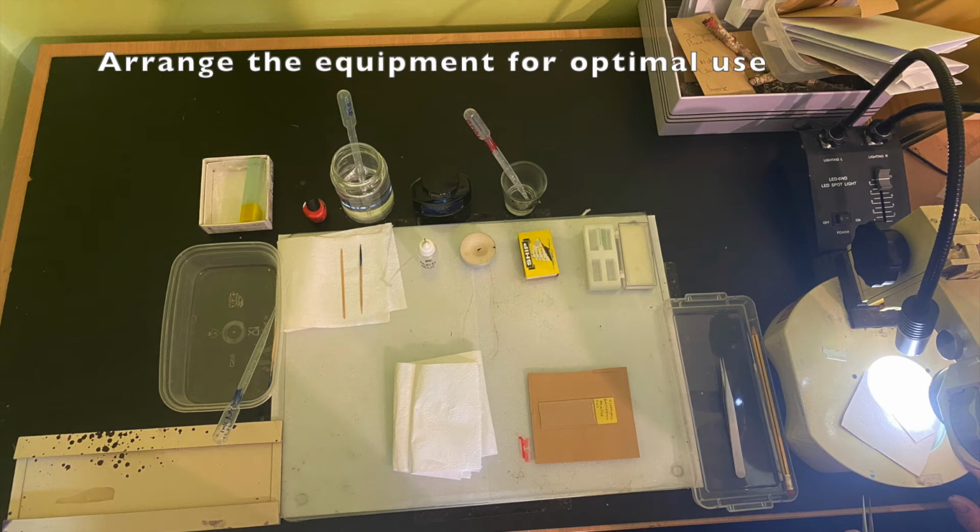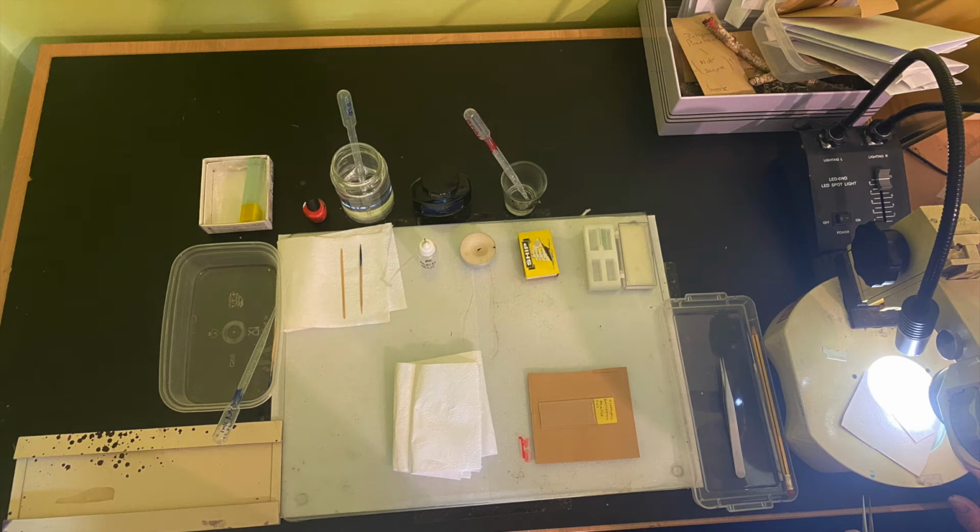Arrange the equipment for optimal use. This photo shows the kit arranged in a way that I find useful. It might take you a few goes to work out the best places to put things. It is quite easy to end up in a bit of a mess, particularly if you combine the staining task with the previous task of cutting sections. As a warning note, you've probably noticed that I'm left-handed, and if you are right-handed, you will probably arrange the kit differently.